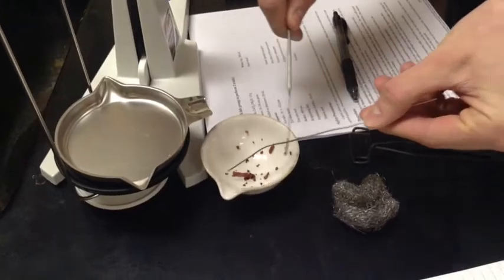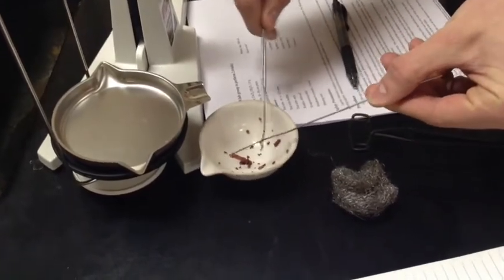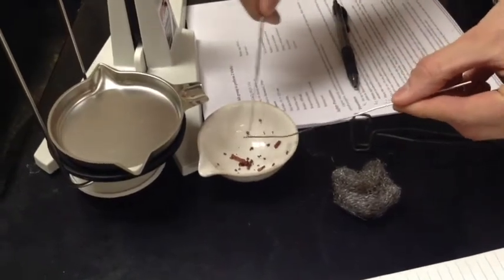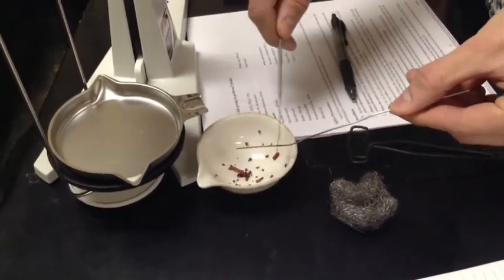The difference between those two numbers is going to give us our actual yield of copper. We also mass the aluminum wire before, and mass it after, and that will give us the actual amount of aluminum that reacted.